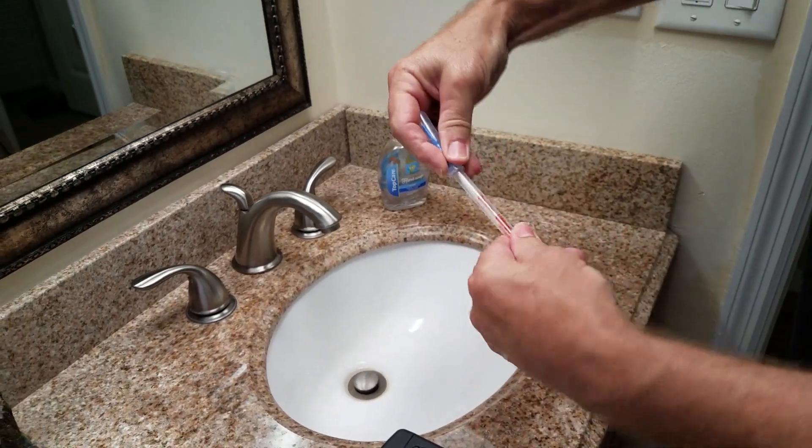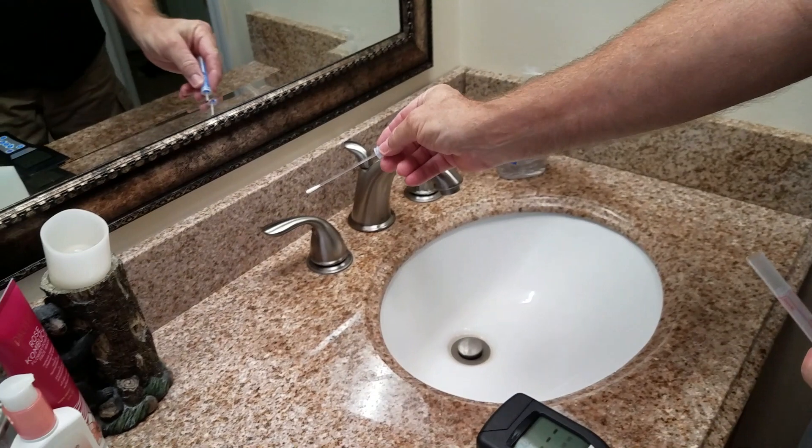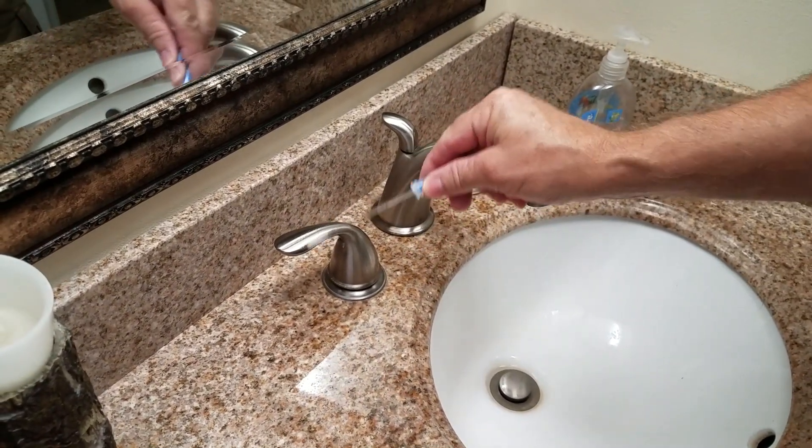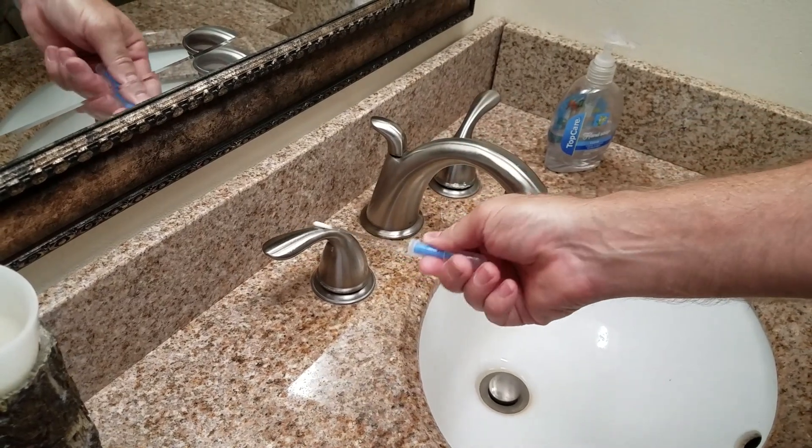We're going to see if we have a surface. This surface was cleaned with typical bathroom products like a bleach product, so it shouldn't be super high of a bacteria count. Let's see what we get.